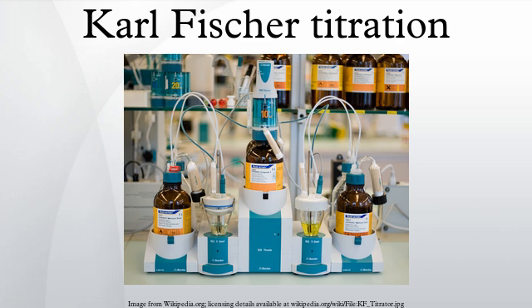Selectivity for water, small sample quantities required, easy sample preparation, short analysis duration, nearly unlimited measuring range, suitability for analyzing solids, liquids, gases. Independence of presence of other volatiles, suitability for automation, linearity, single-point calibration, no calibration curves necessary. In contrast, loss on drying will detect the loss of any volatile substance.